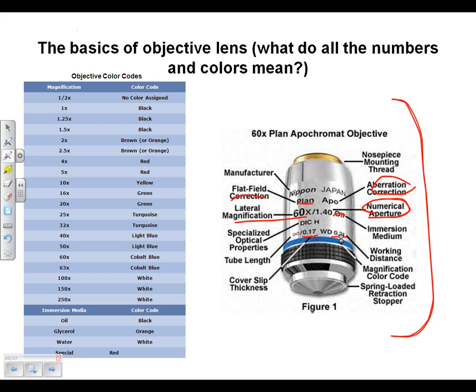And quite often what you'll find is with the cover slips we have, they stick together and you'll have two. And if you have two of them, then they're definitely too thick for the working distance and it really won't work right. The last thing to remember is most of the lenses we have are spring-loaded on the end, so they will move generally out of the way if, for instance, you're a little too close to the slide.